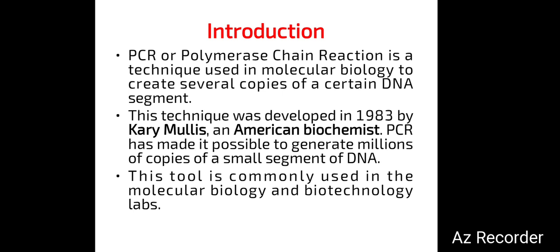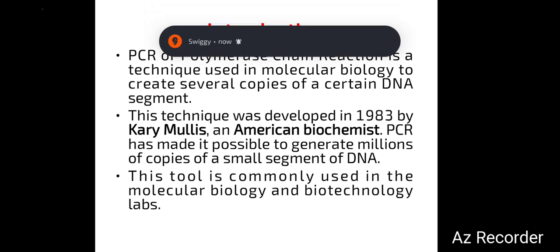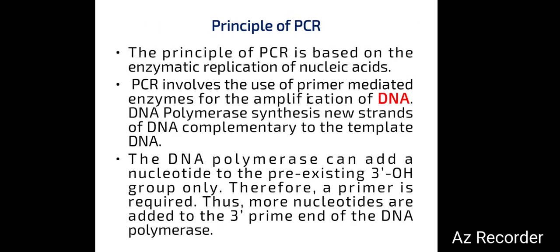It was developed in 1983 by Kary Mullis and is important in modern biology and biotechnology. This technique is widely used in medical diagnosis, forensic science, genetic research, and many more fields. The principle of PCR is based on enzymatic amplification of DNA.